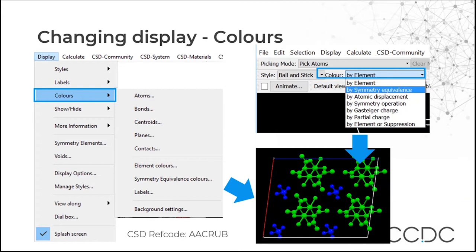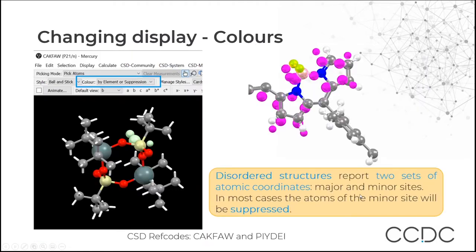As well as changing styles, you can also change colors. Go to Display, Colors, and you'll find a number of options. Like Style, there is also a dropdown in the toolbar at the top. For example, you can color by symmetry equivalent. You can also color by elemental suppression — when a crystal structure has disordered atoms with two sets of atomic coordinates, the minor occupancy sites are normally suppressed in the CSD. You can color those minor occupancy sites in a different color, and two examples of that are shown here.